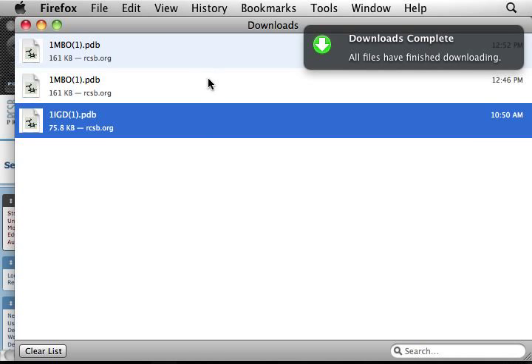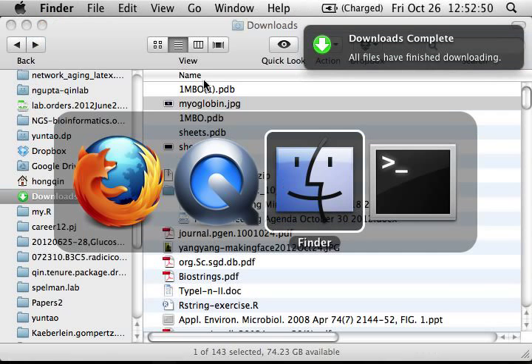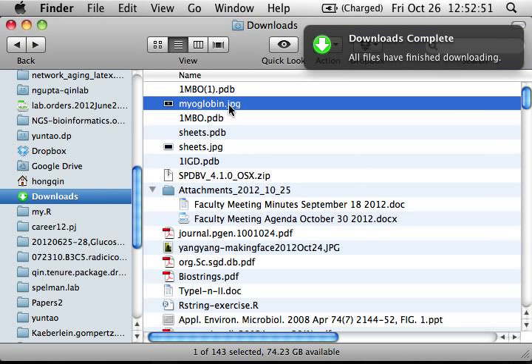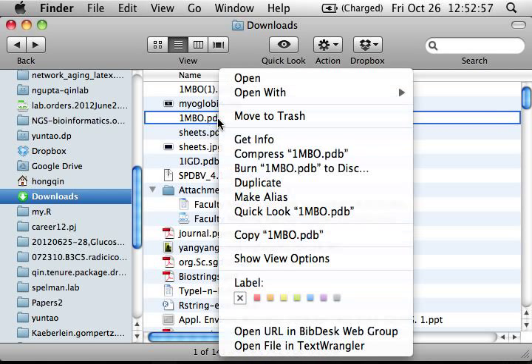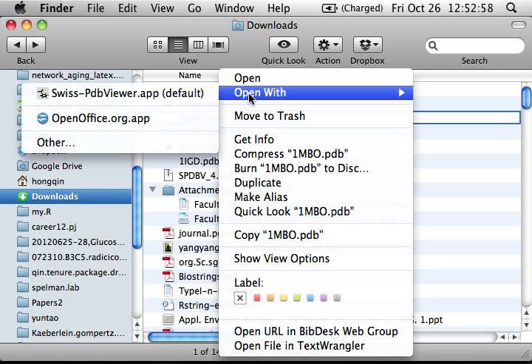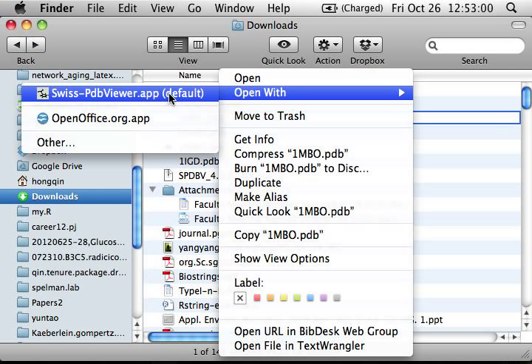Go to the downloads folder, right-click the file, and say open in Swiss PDB application.